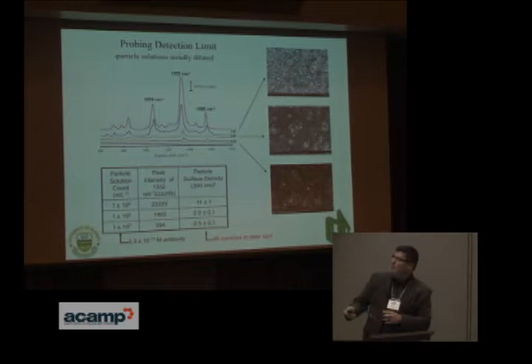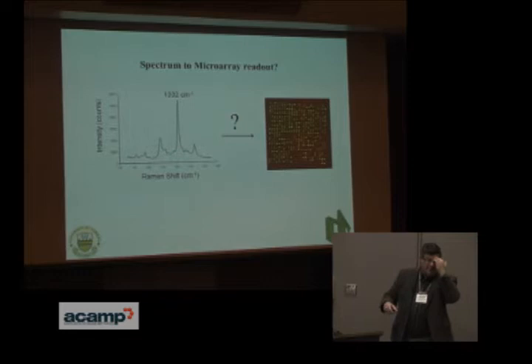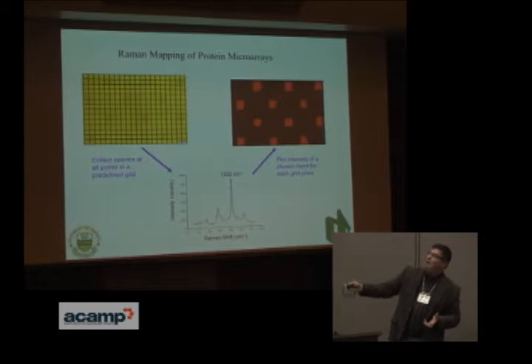In order to do parallel detection on a single chip, this is a photograph of what's known as a microarray, which is a fairly mature technology that's been developed over the last 10 years. Each one of these spots is a DNA-DNA interaction that's detected by fluorescence. And so how do we convert our signal into that? We do what's called a Raman mapping experiment, where we simply take a spectrum across our chip at every point and then convert that series of spectra into an image or a map, where the contrast in the map is plotted from one of the signals of our spectra.